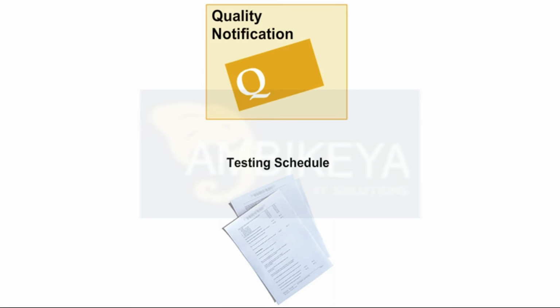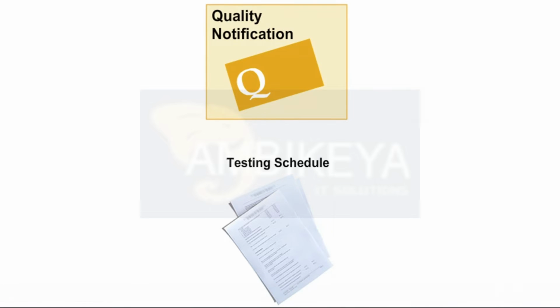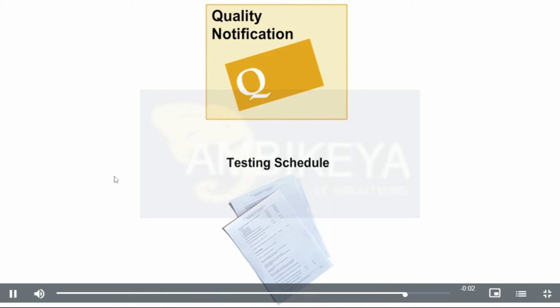The testing schedule is the object for planning the scope and frequency of the stability tests. The testing schedule specifies what is to be tested under storage conditions, when the stability tests are to take place, on the testing dates, and how the tests are to be executed in inspection plans.